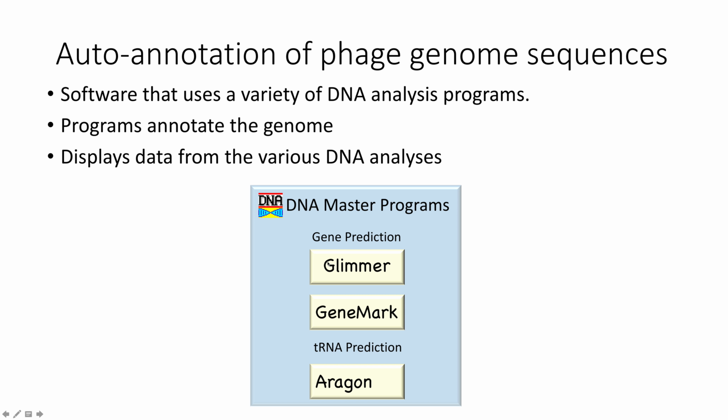We'll talk more specifically about these programs and how they work next week. But in any case, really briefly, what they do is they scan the genome and look for the largest open reading frames in the genome and determine what the codon usage pattern is in those open reading frames. And they determine the coding potential. Then based on those codon usage patterns and the coding potential, they determine where those patterns pop up in other places in the genome, and that's what helps them decide where the genes are in the genome.